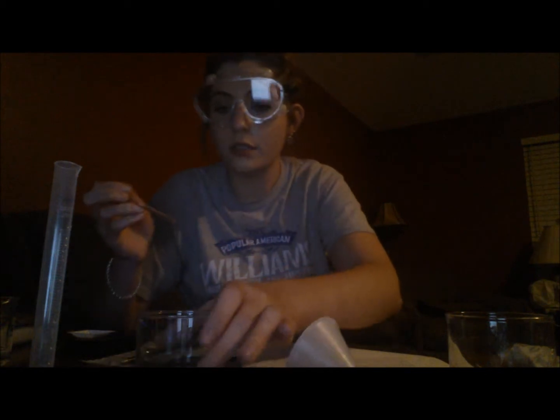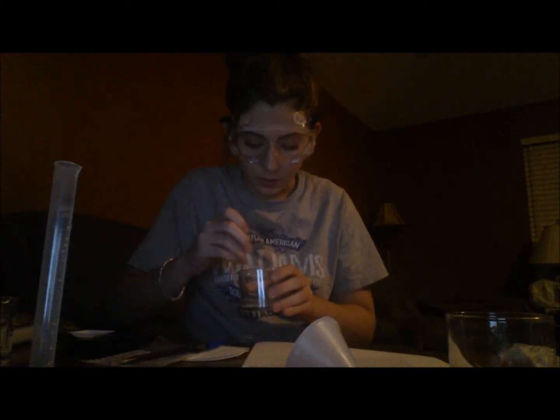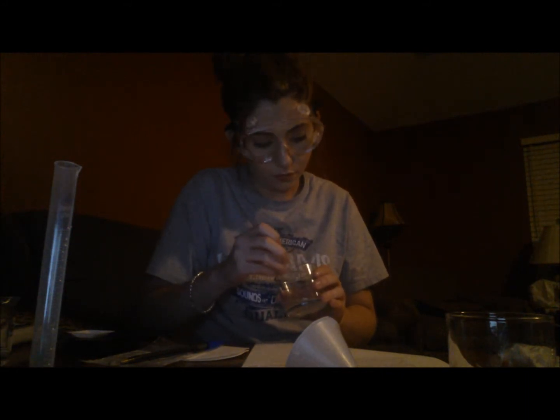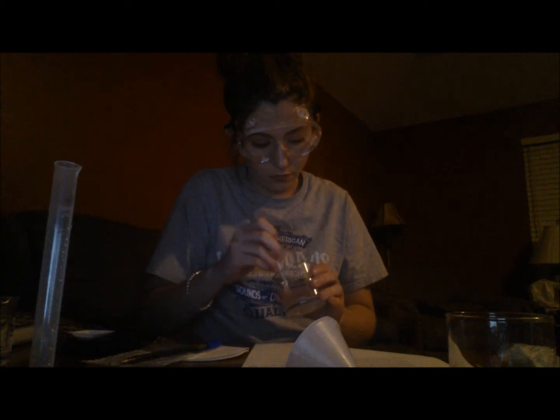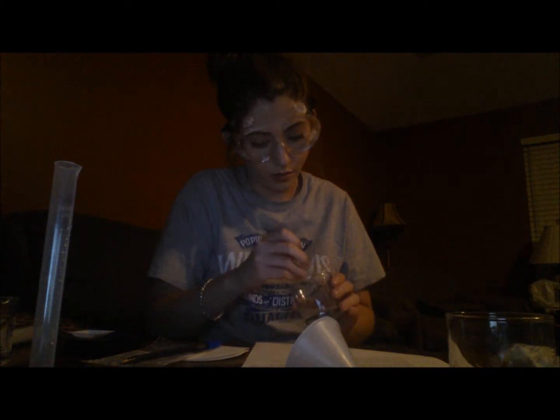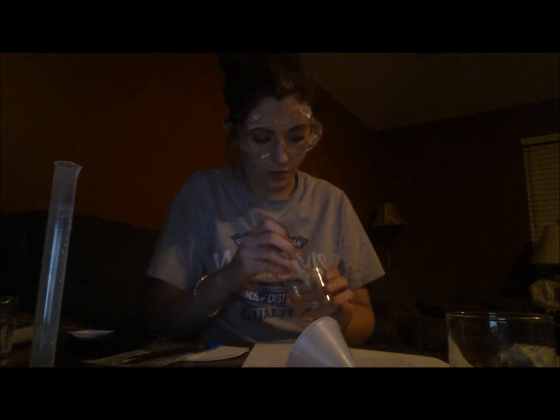Clean off my stirring rod real quick. All right. I'm going to mix this up. So this is not wanting to mix.